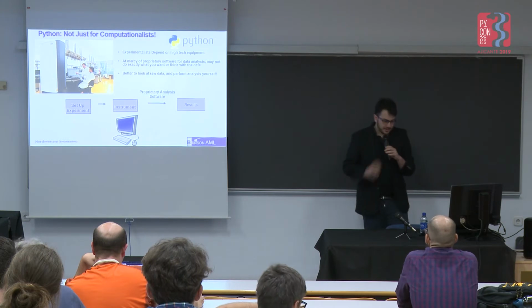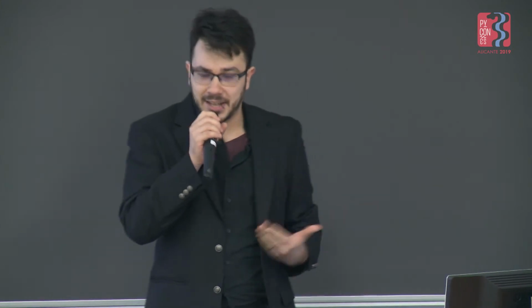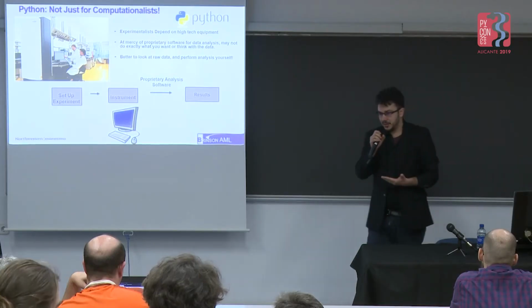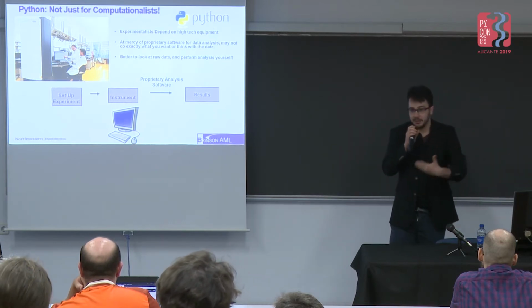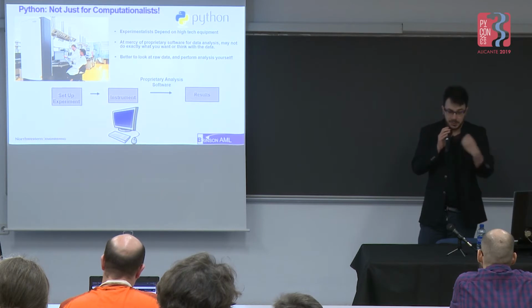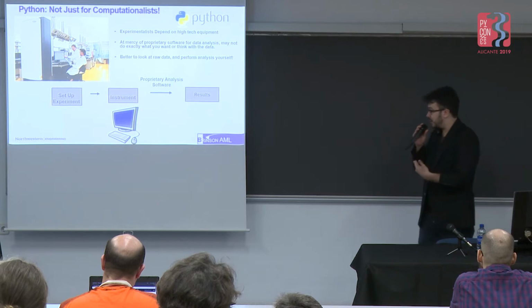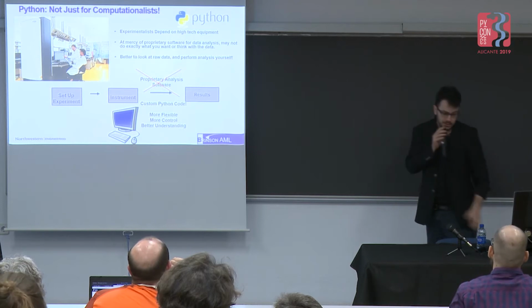So I'm an experimentalist, and we deal with a lot of very fancy, high-tech equipment, and basically, these scientific instruments typically have their own proprietary software to use to analyze the data. A lot of times, it doesn't always do exactly what we want, or we may not understand exactly how they analyze the data, and that can be a problem if we want to do specific things. So it becomes beneficial to be able to manipulate and extract the data ourselves in order to get better quality results. And Python is a very helpful tool in order to do that.